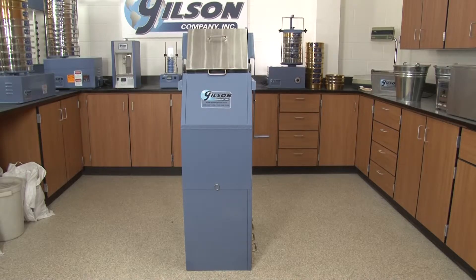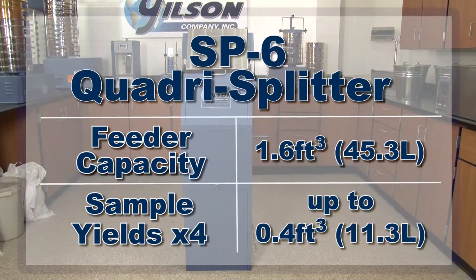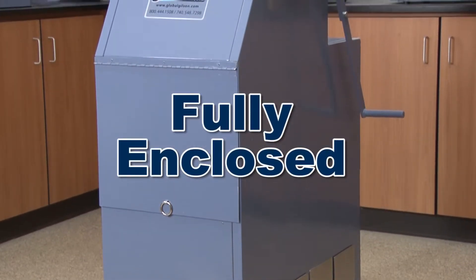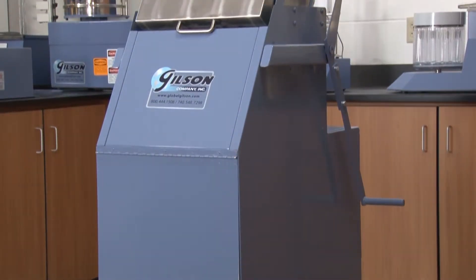Especially suited for coal and coke, since moisture loss is minimized, the Gilson Quadra Splitter yields four equal samples of up to 0.4 cubic feet each, for a total sample capacity of 1.6 cubic feet, while the fully enclosed design contains dust and prevents moisture loss during operation.